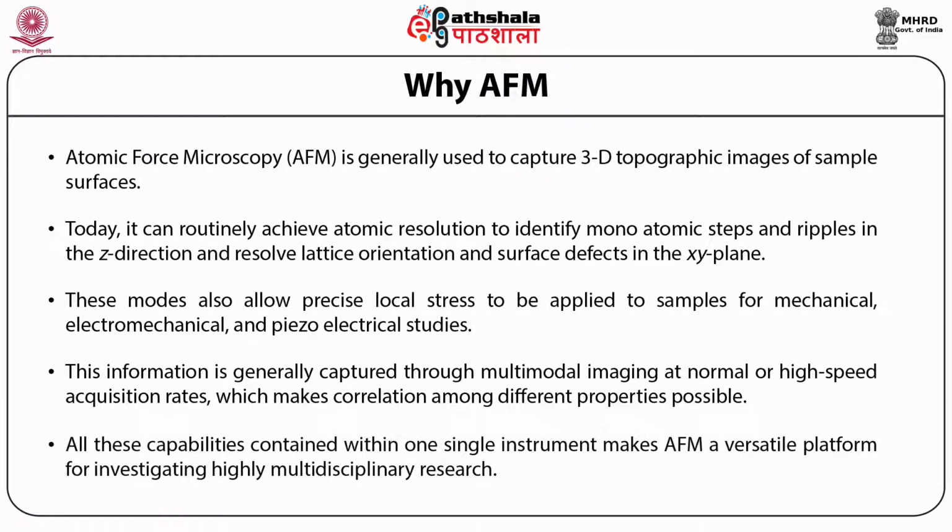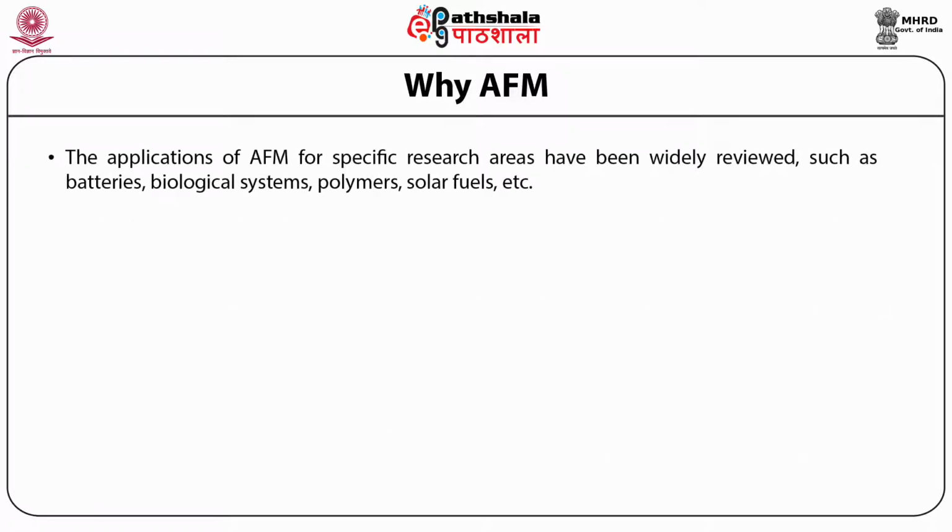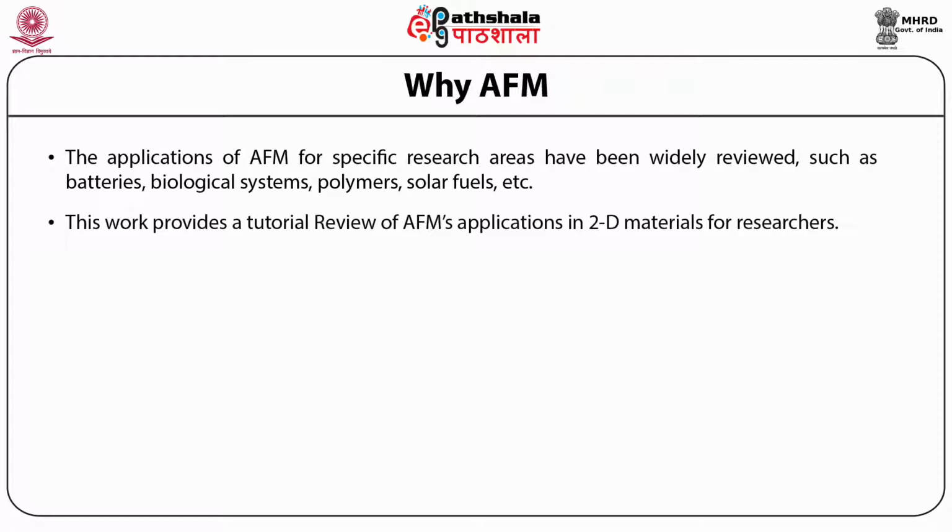All these capabilities contained within one single instrument make AFM a versatile platform for investigating highly multidisciplinary research. Therefore, AFM stands out among other techniques for investigation of 2D materials. The applications of AFM for specific research areas have been widely reviewed, such as batteries, biological system, polymer, solar, fuel, etc. This work provides a tutorial review of AFM's applications in 2D materials for researchers.